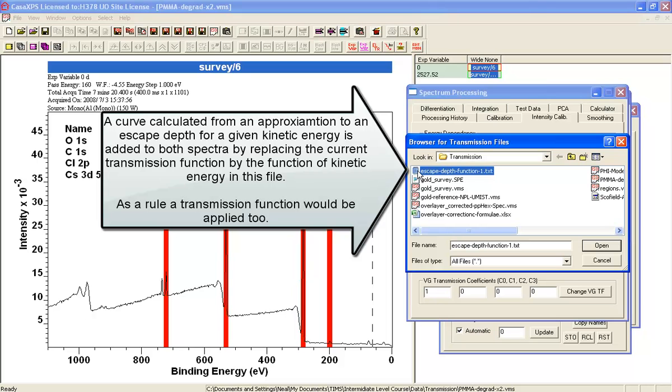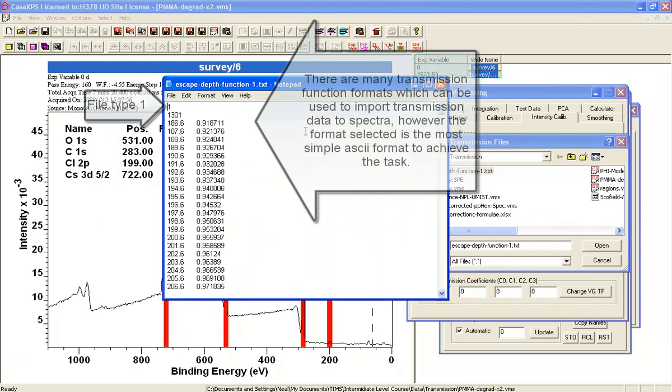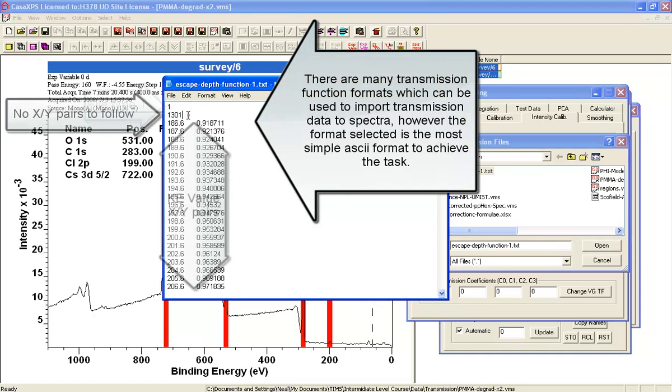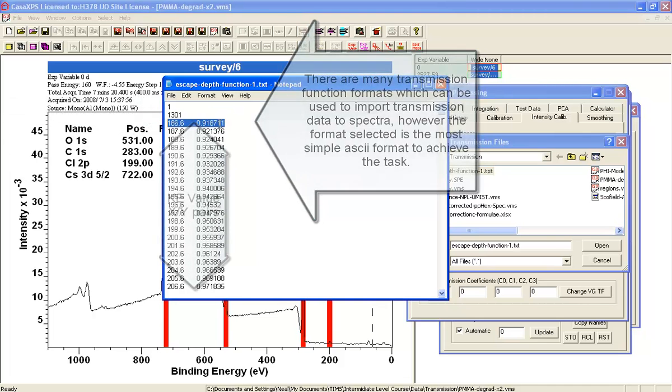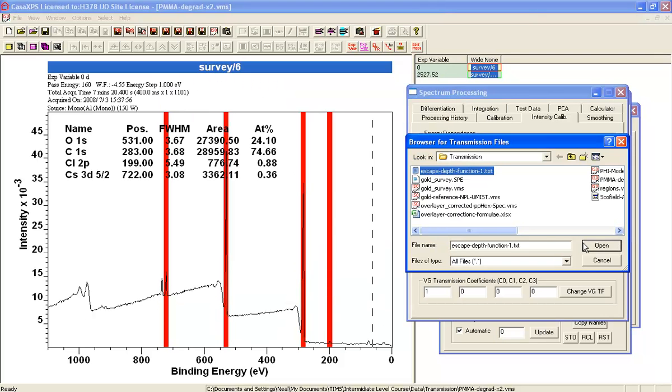If I open this file and edit with notepad, you can see it's got the type, the number of entries, and then pairs of kinetic energies and a scale factor. For each one of these kinetic energies, there's a different scale factor.